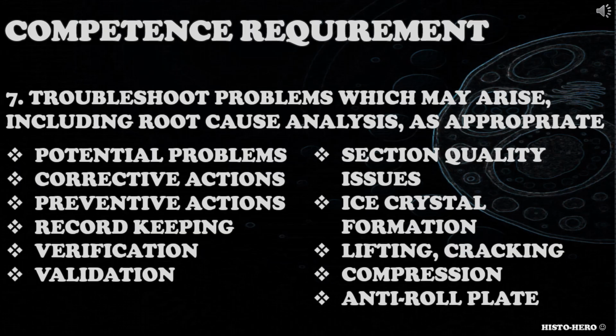When addressing this competence requirement, candidate could consider potential problems like wrinkled or compressed section, curling, chatter, scores, lifting or cracking, thick and thin cutting, ice crystal formation, anti-roll plate, pre-cooling tools, corrective actions taken, preventive actions, record keeping, verification and validation, ways of contacting manufacturers and so on.